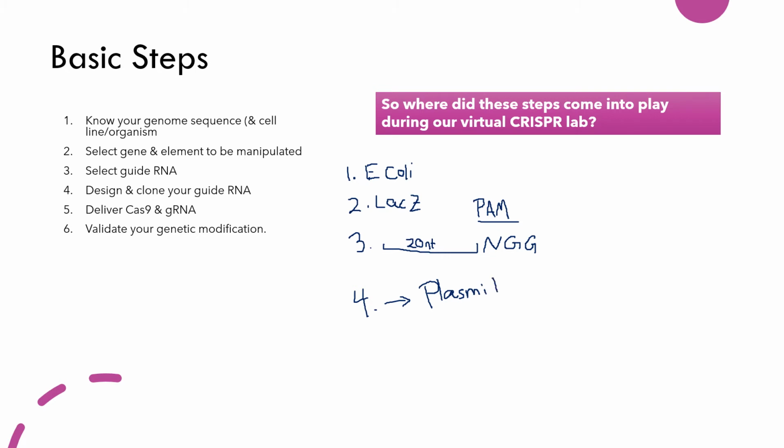So when it's in E. coli, the promoter drives the production of an RNA transcript. Okay, so that's why we had to use that p-target plasmid, and we'll look at that again in a second. Okay, transcript.